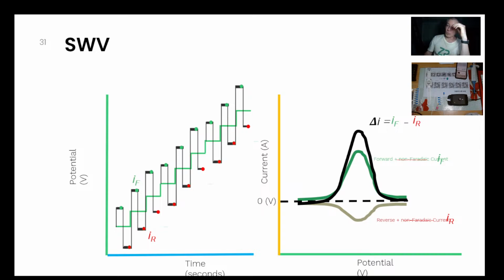I would say one thing, that reasoning actually works out that square wave voltammetry is more sensitive than cyclic voltammetry. It definitely is more sensitive than cyclic voltammetry. In fact, our sequence of events would be, when we're first starting an assay, we'll do cyclic voltammetry just to get a sense of where oxidations and reductions are taking place.